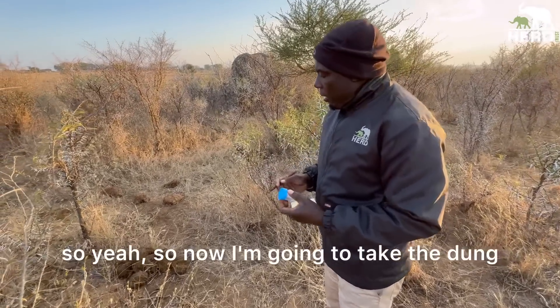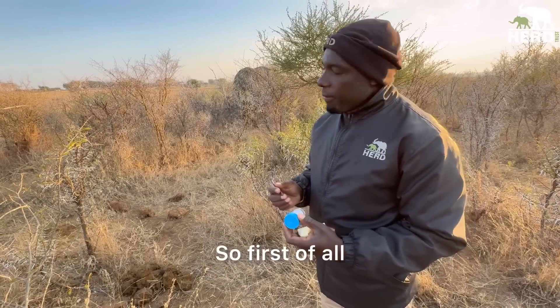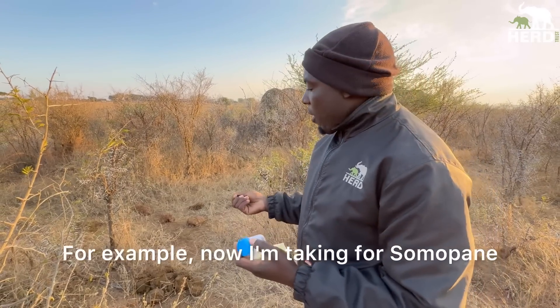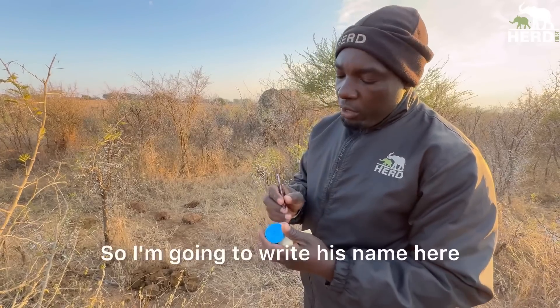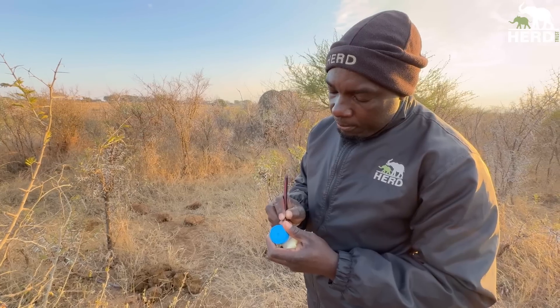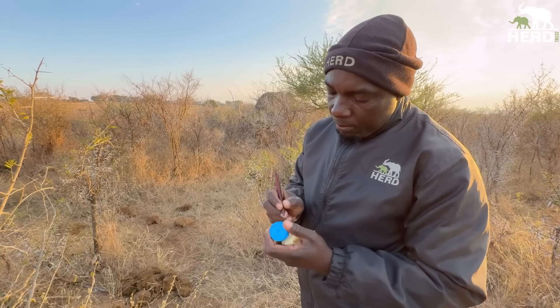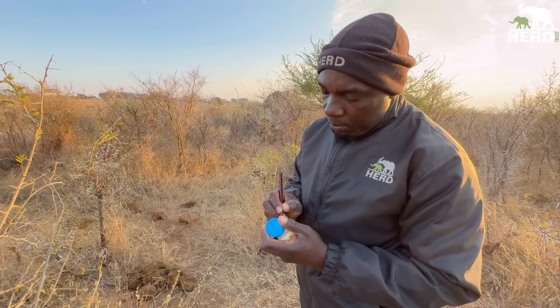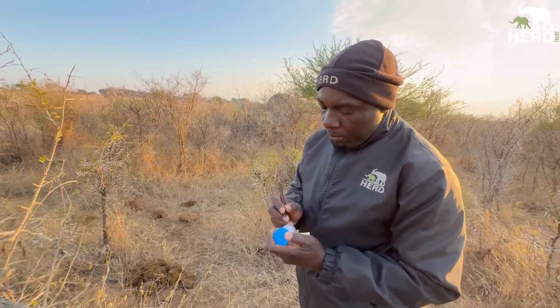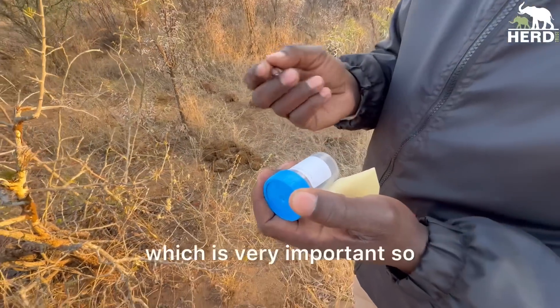Okay, so now I'm going to take the dung samples for Summer Pony. First of all, I'll write the name of the elephant that I'm taking the dung for. For example, now I'm taking for Summer Pony, so I'm going to write his name here.